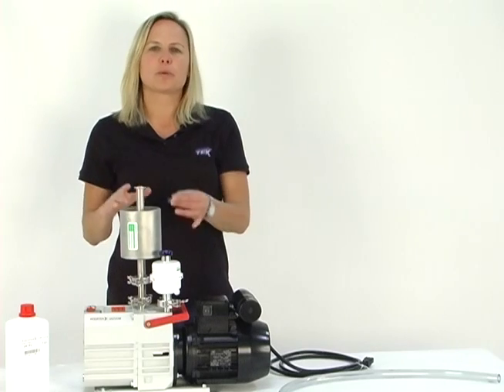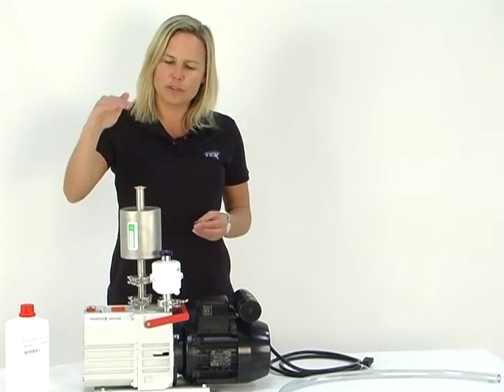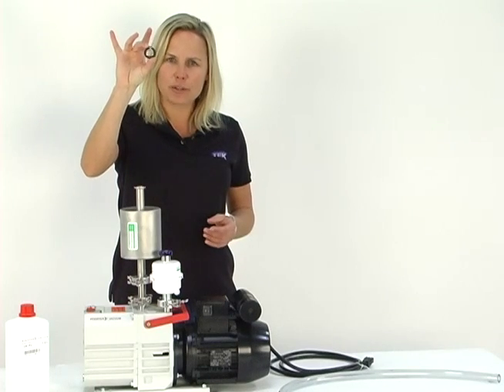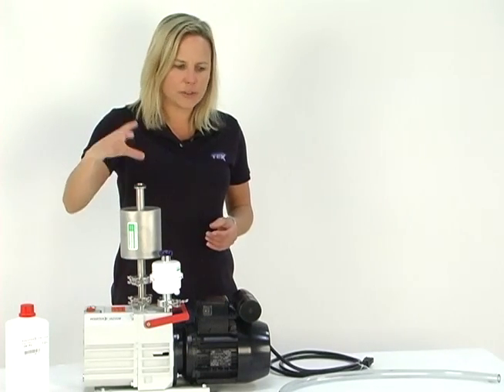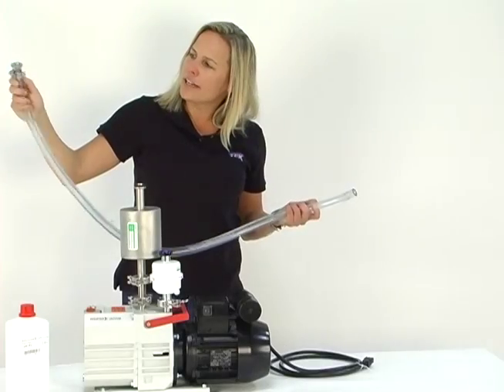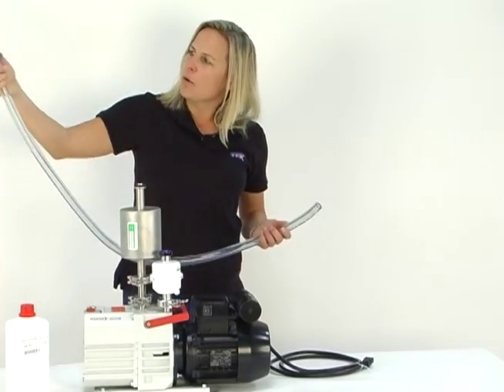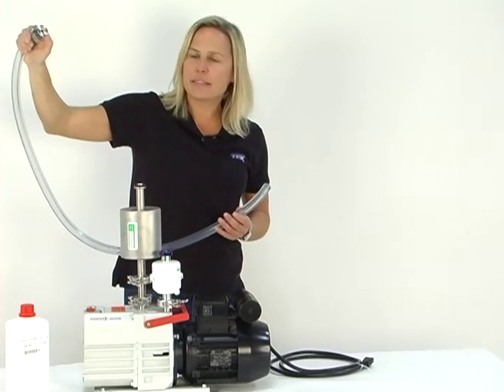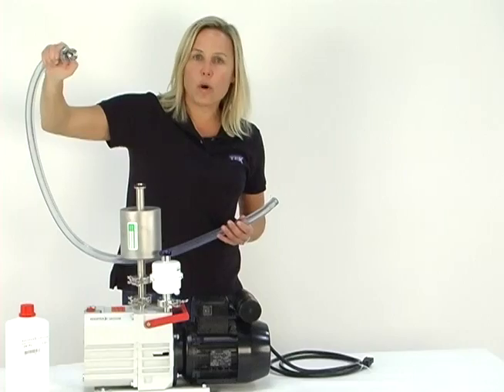The final step is we're going to connect the vacuum hose to the top of the foreline trap. Anytime you make these connections, you grab your centering ring and seat it on top of the foreline trap. Now let's grab our vacuum hose. On your connection kit, you'll see the end with this barbed, flanged fitting — that is the end that will go on the foreline trap.